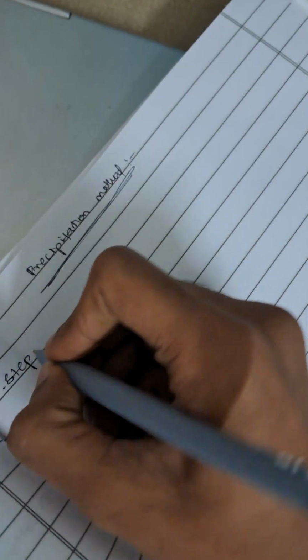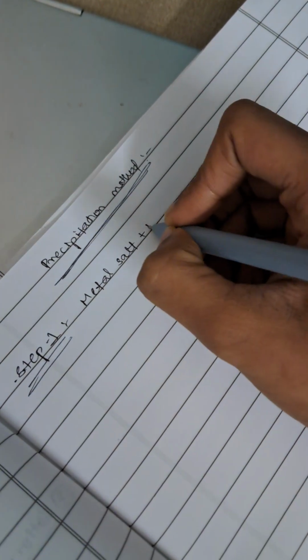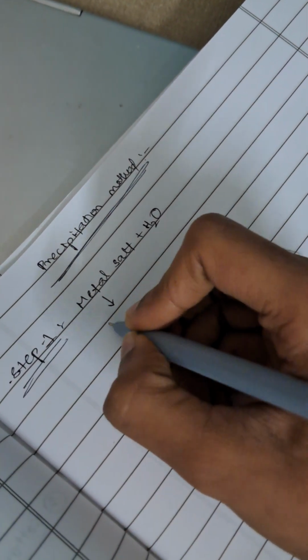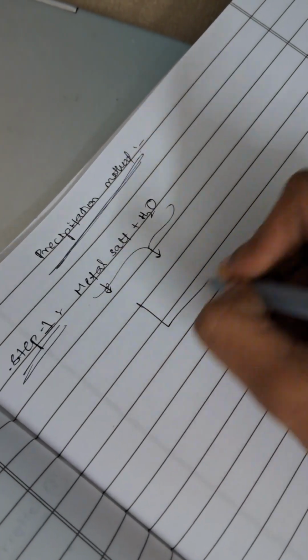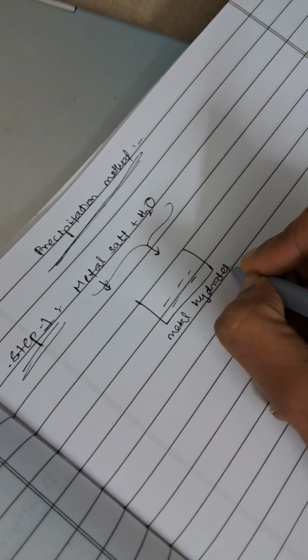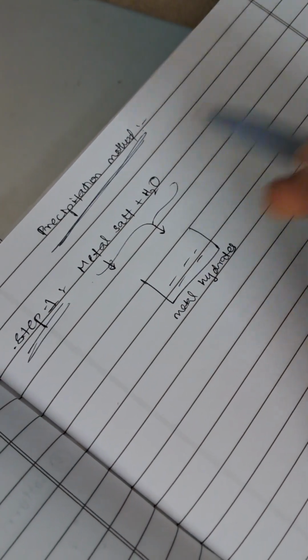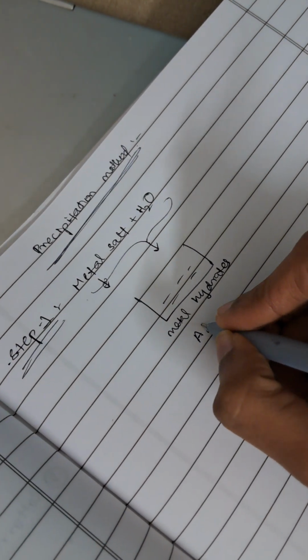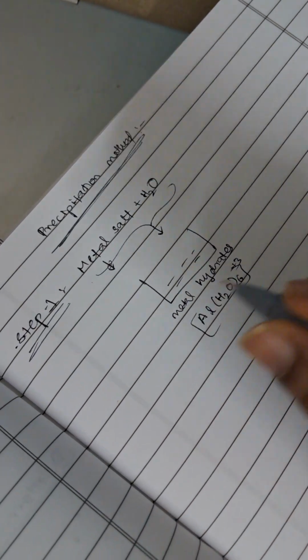Step 1: Metal salt dissolved in water. Metal salts like metal acetate, metal chlorides or metal nitrates are dissolved in water to form metal hydrates. Here the metal ions combine with water to form a metal hydrate complex. For example, if the metal is aluminium, then Al(H2O)6 3+. In this way, metal hydrates are formed.